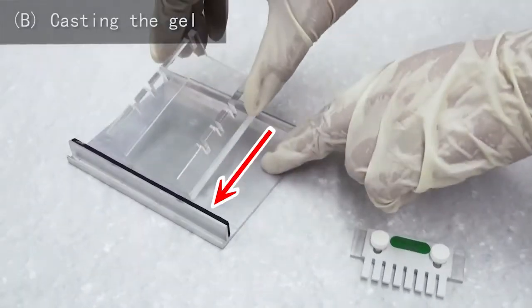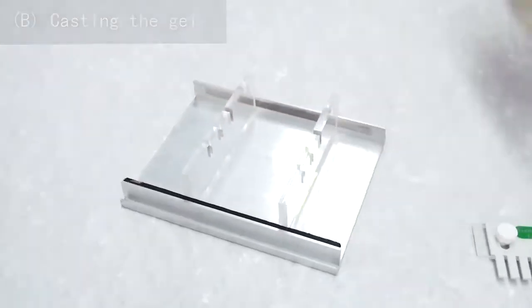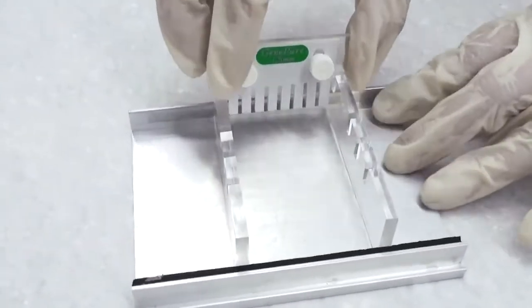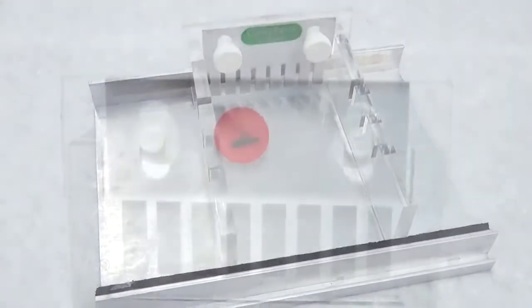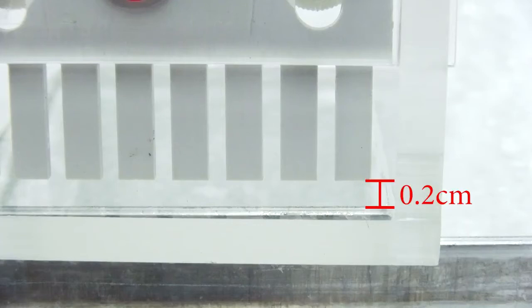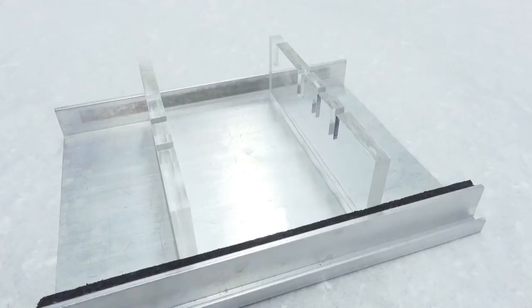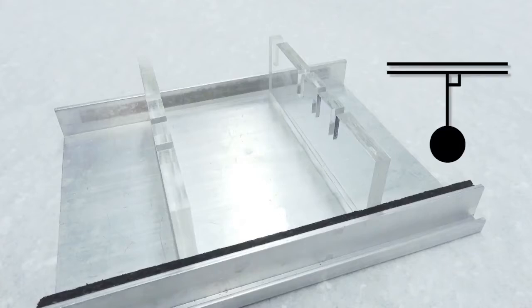Place the clean and dry gel tray into the casting plate. It should be a tight fit. Install the comb and adjust the height so the bottom of the comb is 0.2 centimeters above the inner surface of the tray. On the outside of the tray, mark 0.5 centimeters above the inner surface of the tray. Remove the comb and place the casting plate on a level table.